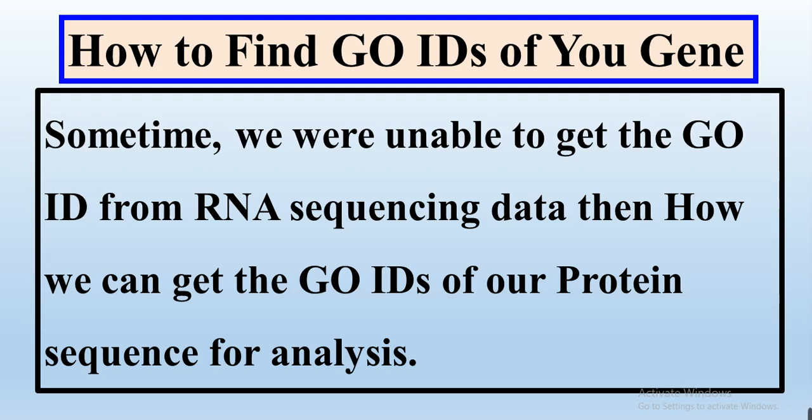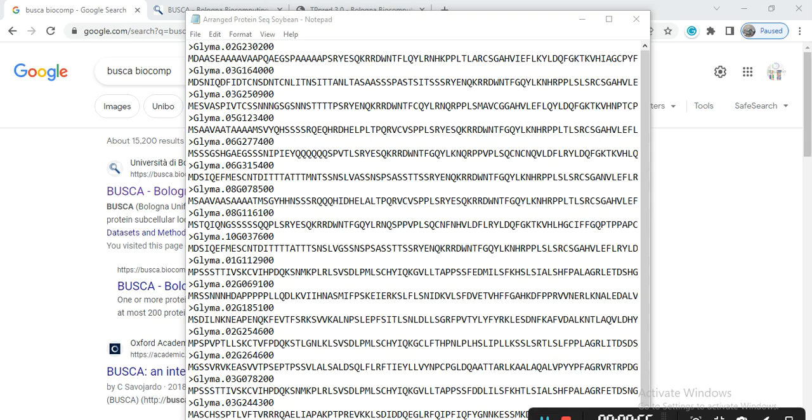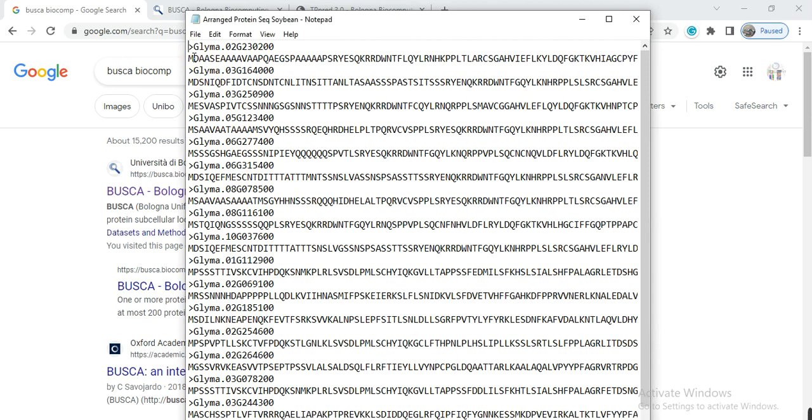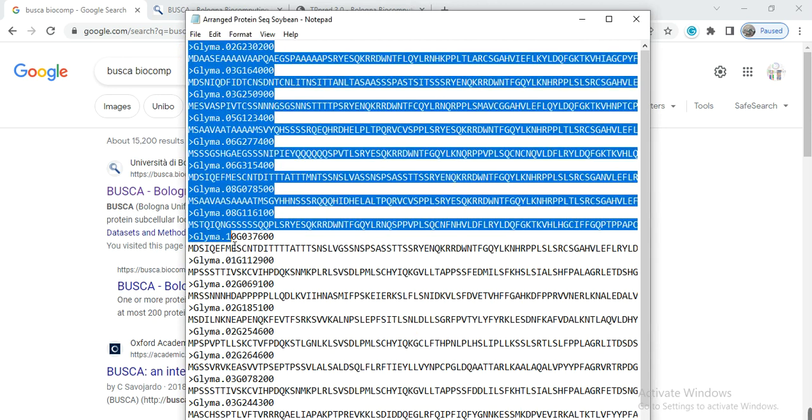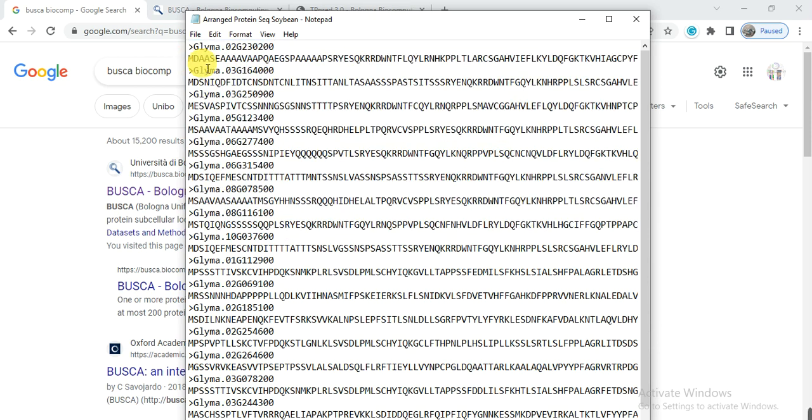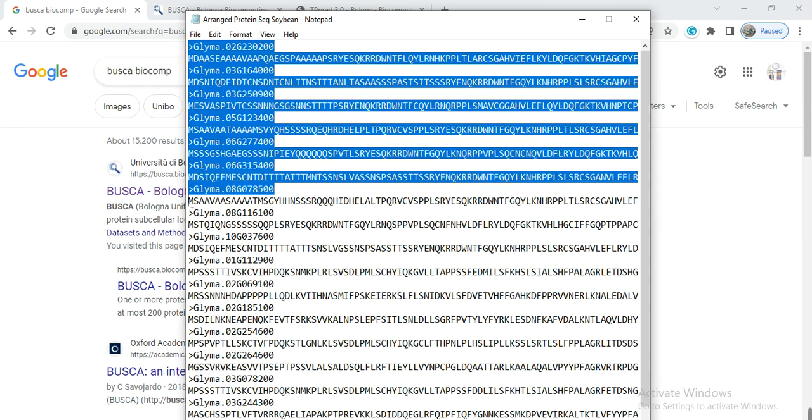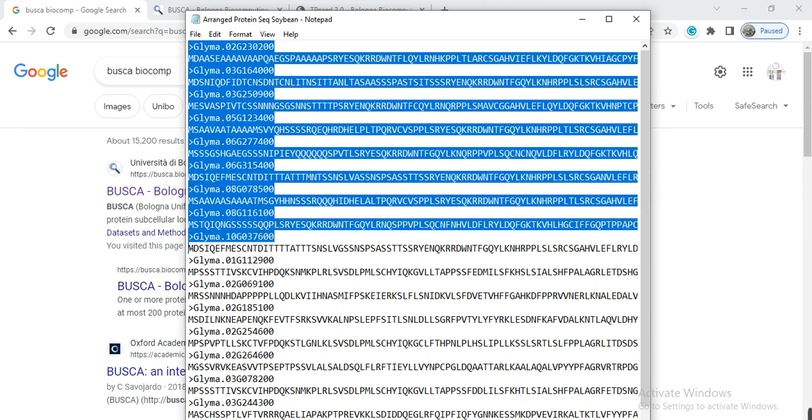So first, you need to copy the sequence of your gene. Like here, these all are genes on which I am working. So I want to know the Gene Ontology or GO IDs of these genes. You can use one gene or multiple, it depends on your objective. So first I take these genes and copy.